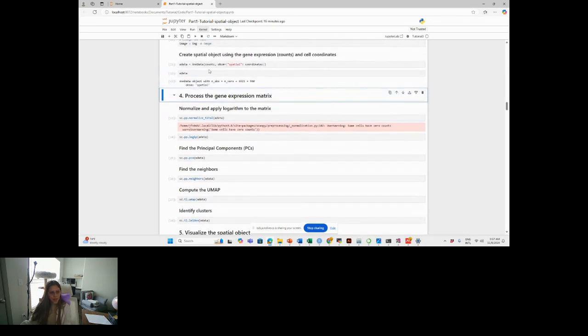Yes. So we're going to have the gene expression of the cells, and as Dr. Flores was mentioning, we're going to normalize it. To normalize it, as I already told you before, we already have a function that is going to do that for us. So we're going to run it. For each gene in one cell, that function is going to divide it by the total transcript expression from that cell. And then you multiply by a factor. It can be 1,000, it can be 10,000, whatever factor you decide. It's just to make the values a little bit larger since the matrix is very sparse. And then we apply a logarithm to the values to make them comparable.